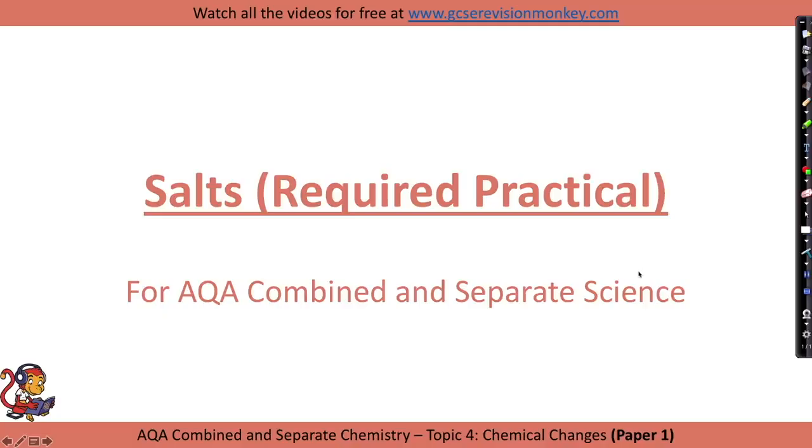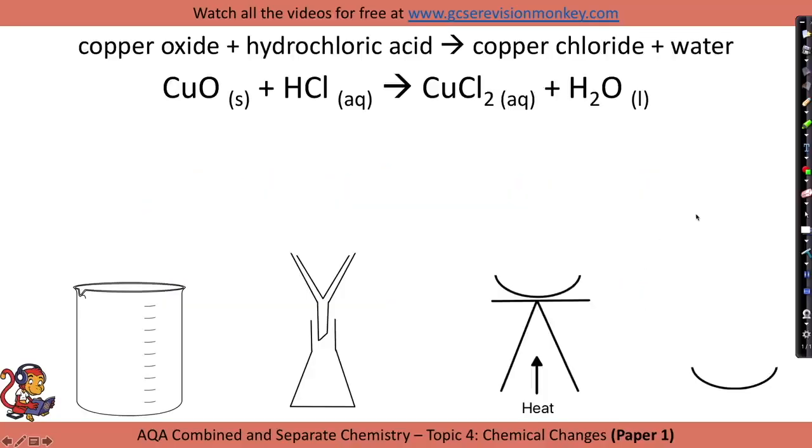Salts required practical. So, if you react an acid, like hydrochloric acid, with a base, you will make a salt plus water. Now, in this case, the base we're using is copper oxide, and we're adding it as a solid, which indicates that it's probably an insoluble base, which it is, which means it doesn't dissolve in water. So we can't make it into a solution and add it, we add it as a solid itself.